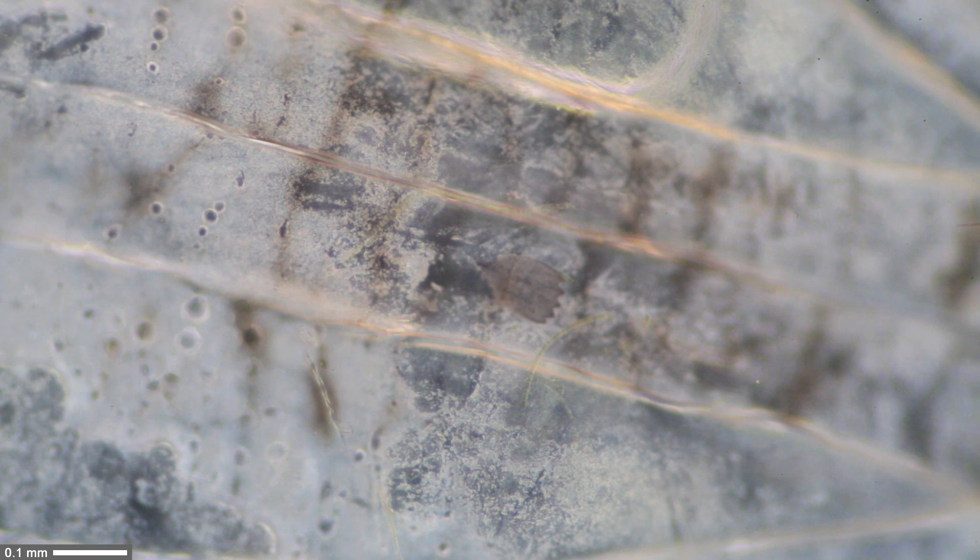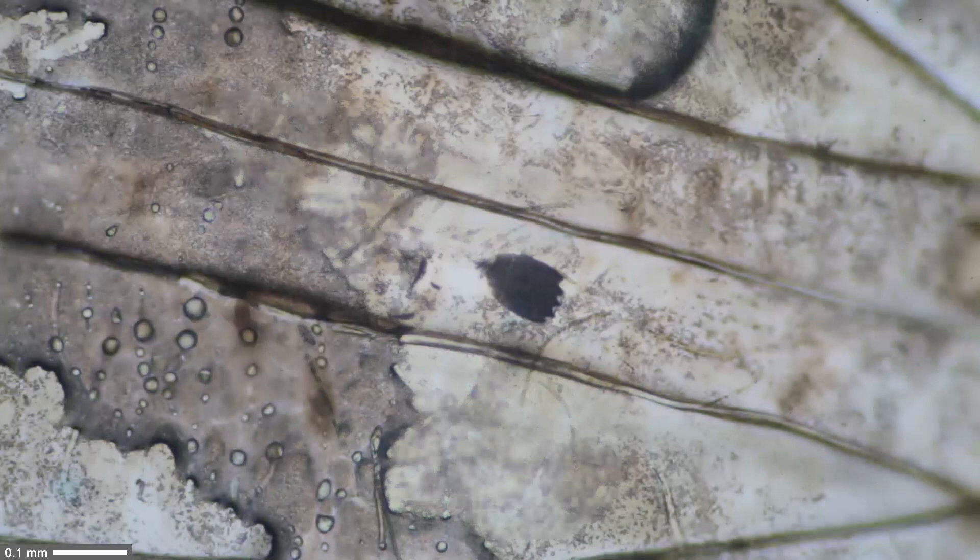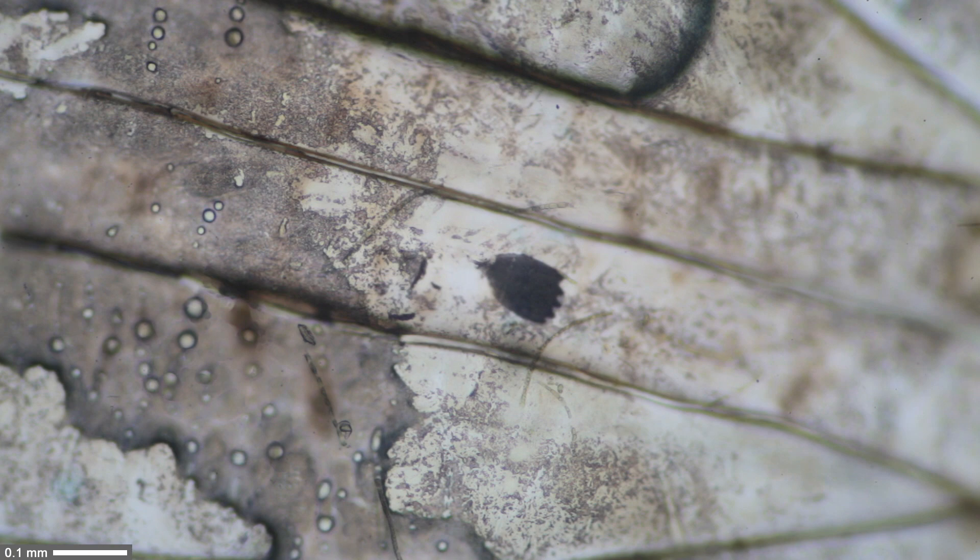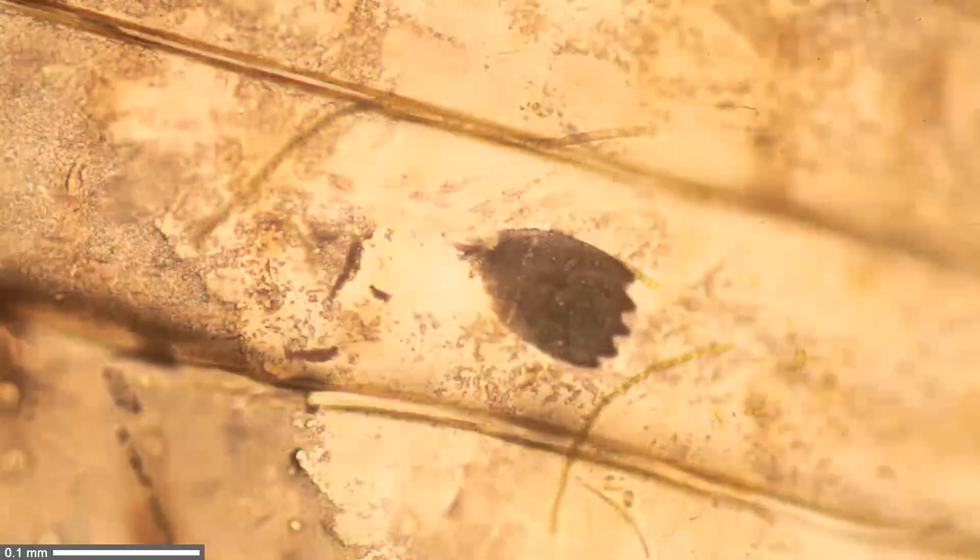Now I'm back in bright field. You can actually see that in bright field, the scale can be seen much better than in dark field. What you have to do in microscopy is you have to try different mounting media, you have to try different illumination techniques, because different techniques are suitable for different things that you want to observe. That's again in dark field, and you can see that the contrast of the scale is not as high as in bright field.